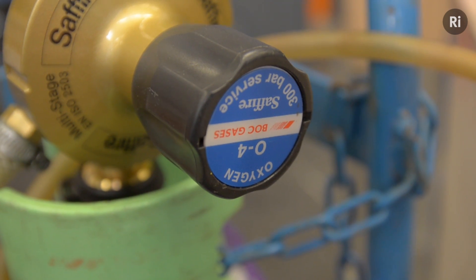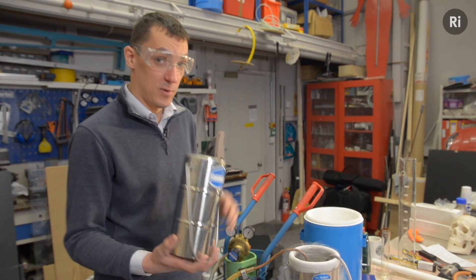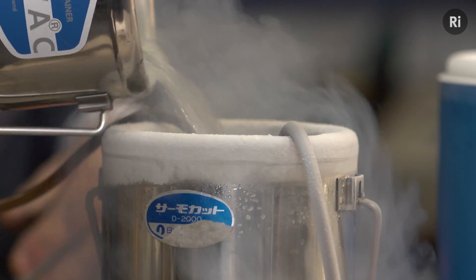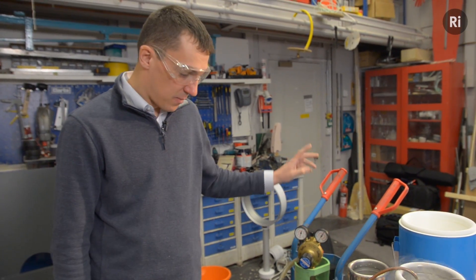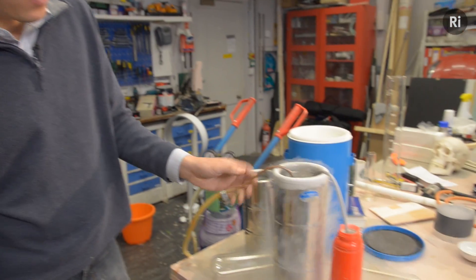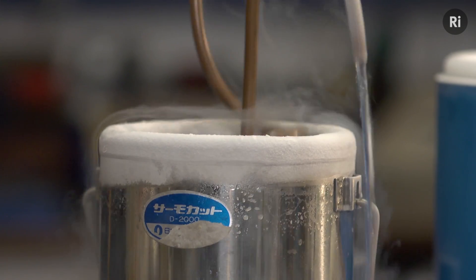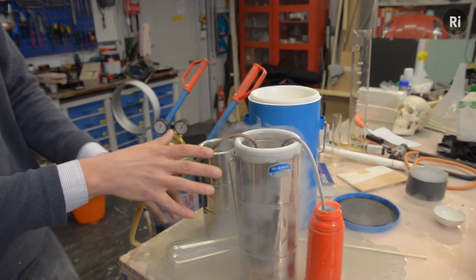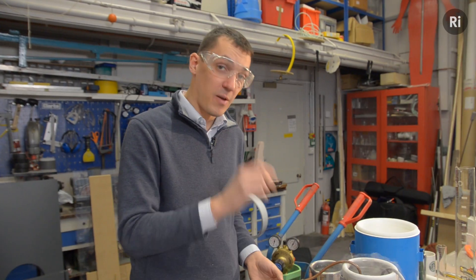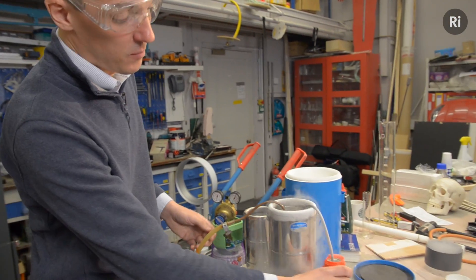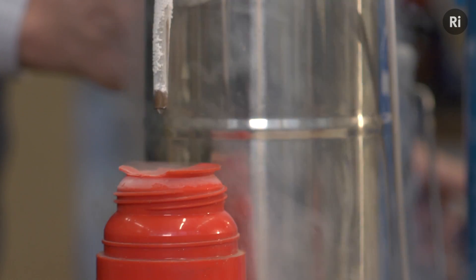Making liquid oxygen is pretty straightforward if you happen to have some liquid nitrogen, which I do. So what I've got here is my cylinder of oxygen, and I'm passing the oxygen through this copper coil here, which is immersed in liquid nitrogen. The oxygen has a higher boiling point than the nitrogen, so it condenses in the coil, and by the time it comes out the other end of the tube, it's a liquid.